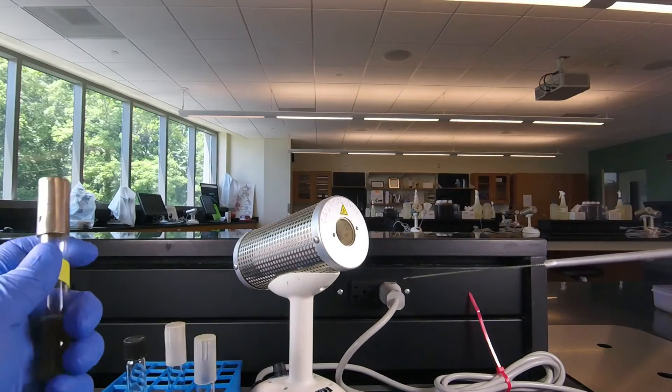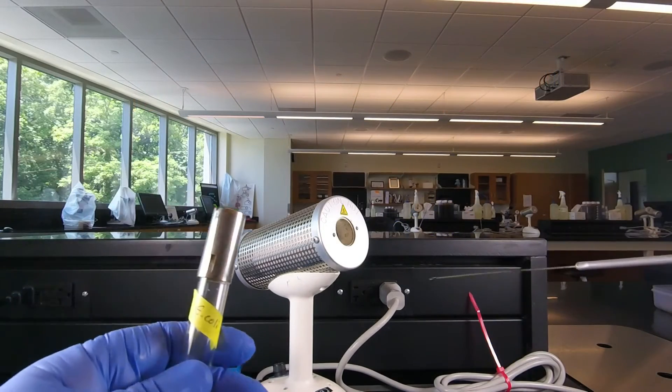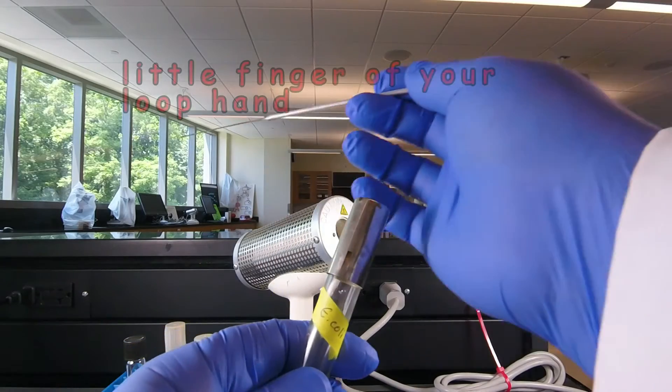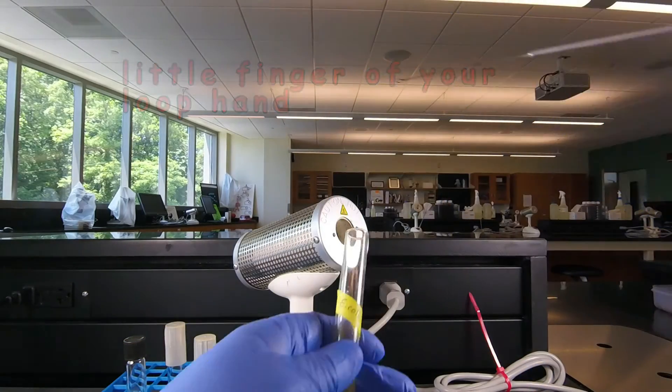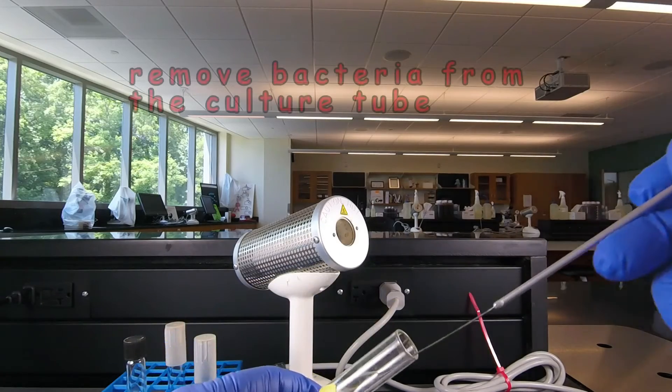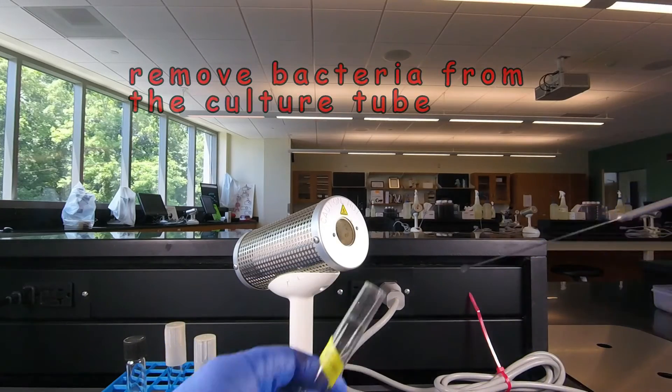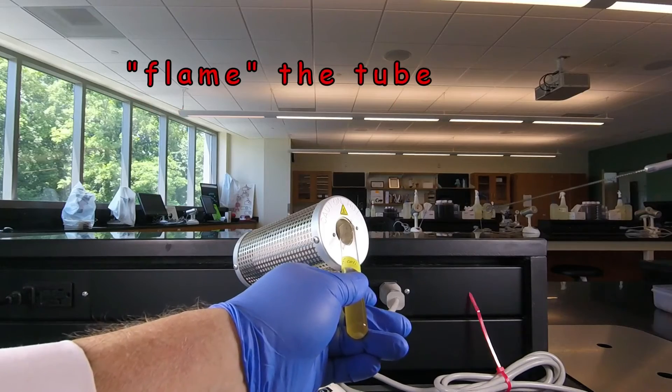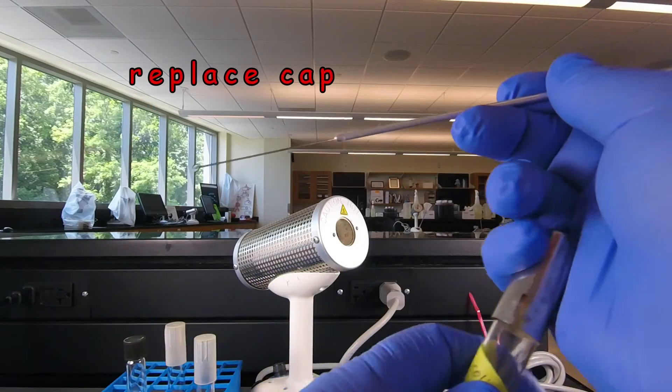Take the tube of bacteria we want to grow, our pure culture, in this case it's E. coli again. Remove the cap with the little finger. Flame the tube for three seconds. Remove a loop full of the E. coli. Flame the tube for three seconds. And replace the cap.